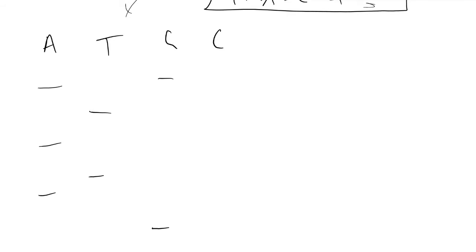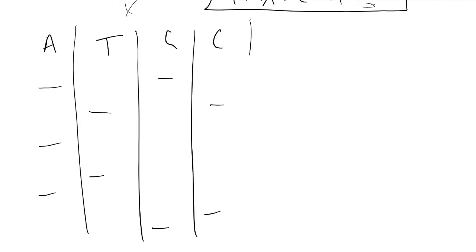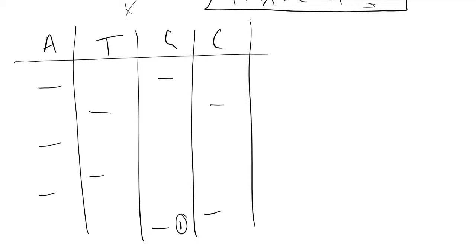The shortest fragments would get through first, so our ladder would look like this. If we look at which fragments of DNA travel the farthest, that means they are the smallest. Whichever ones got through the quickest tell us the order that the DNA base pairs made it through.